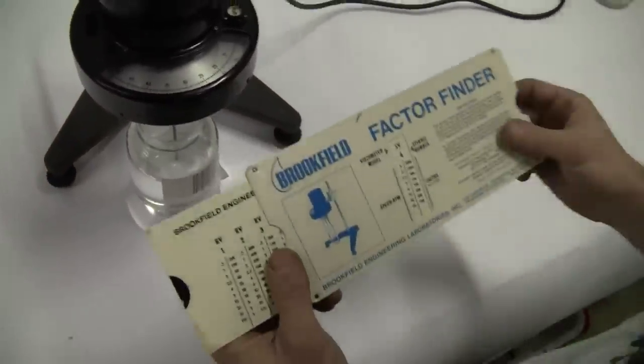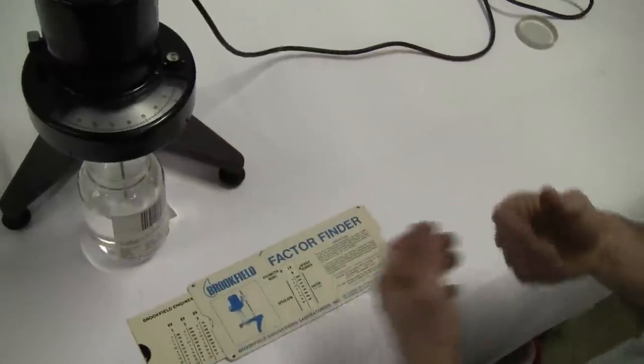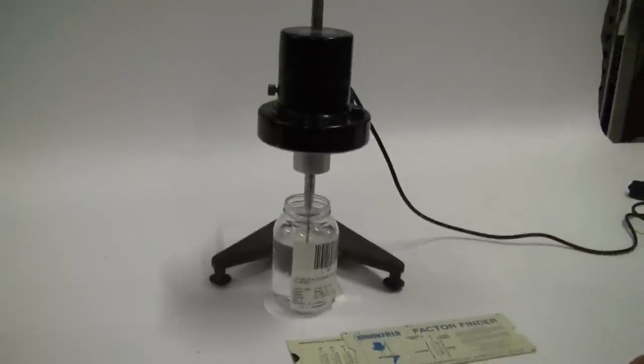We go to our chart here. It's an LV model viscometer. Down to 12 RPMs, our factor is 500. So that gives us 15,500 centipoise. Well within range of what we'd expect.